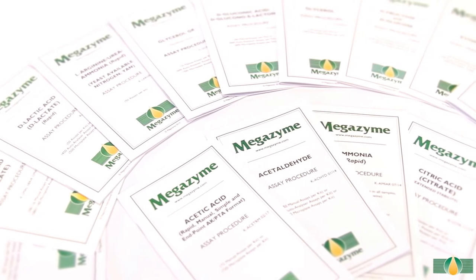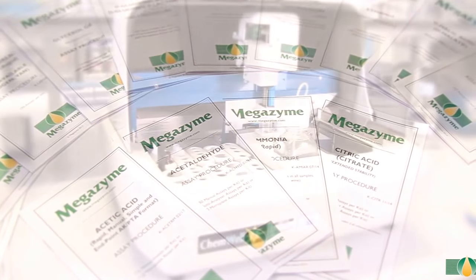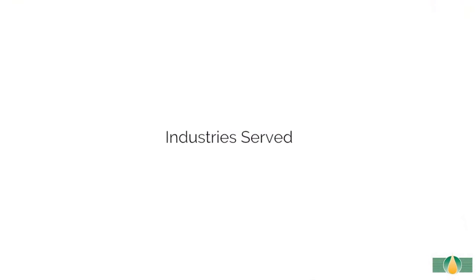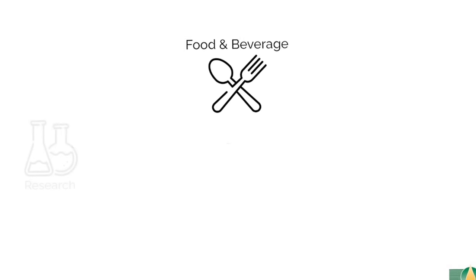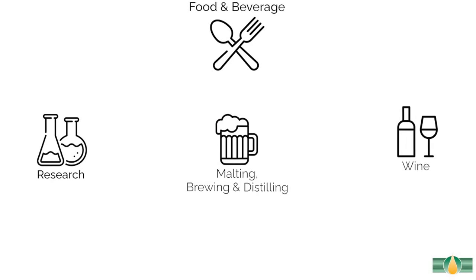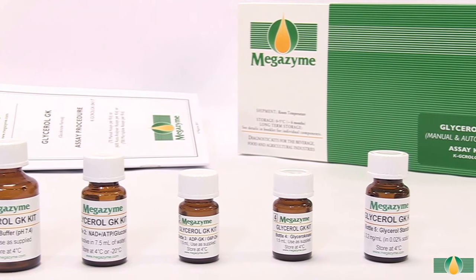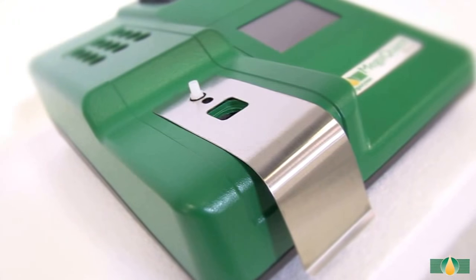Megazyme provides an extensive range of assay kits for use in various assay formats including auto analyzer, microplate, and manual spectrophotometer. This glycerol assay kit can be used to accurately measure glycerol in various sample types throughout industries such as food and beverages. This video tutorial will demonstrate the use of the assay kit with a wine sample using the manual spectrophotometer format.